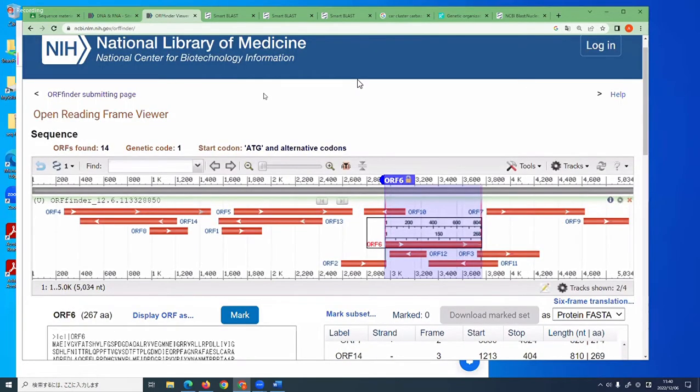We had to do the ORF, then copy the information, go to SwissProt, paste it, and wait for SwissProt, which was very slow. After doing 5 or 6 genes, you had so many things copied and pasted that you lost track of what's happening. So this is a lot easier, and everything is in the cloud, so it makes things very easy to work with. All right.